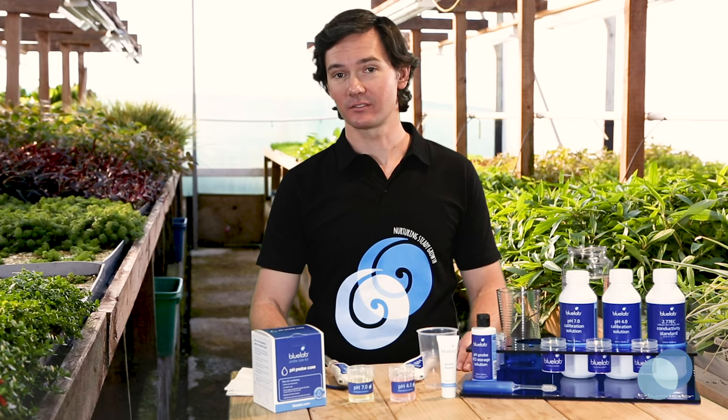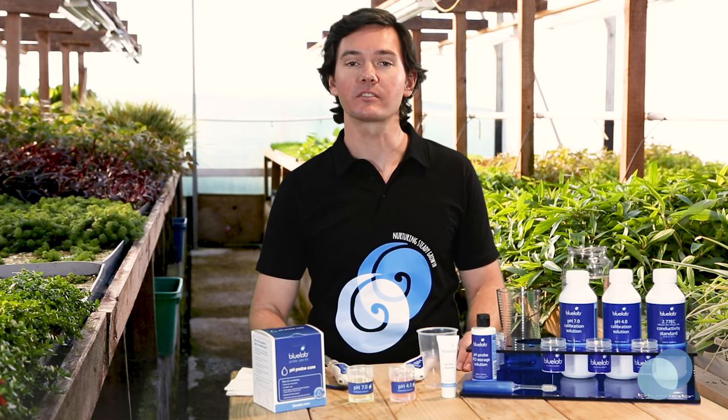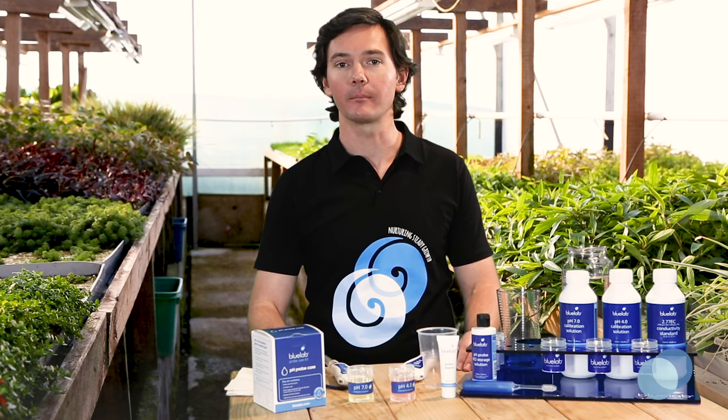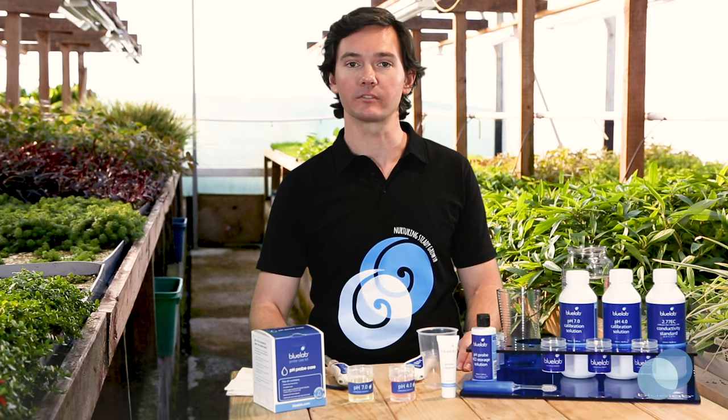To make the best decisions for your horticultural business, you need to get the best performance from your equipment. To ensure you get the right readings, you need to ensure your instruments are accurate. We recommend you clean your pens every 30 days. The calibration indicator will disappear to remind you that it's time to clean and calibrate again. If you're getting an unexpected reading, it doesn't hurt to calibrate sooner.